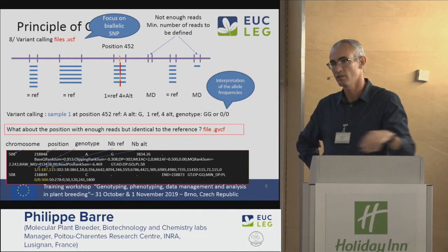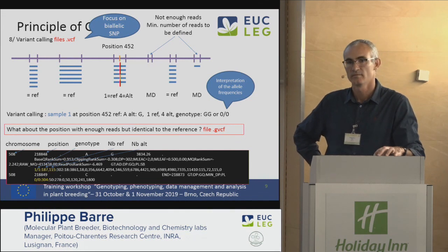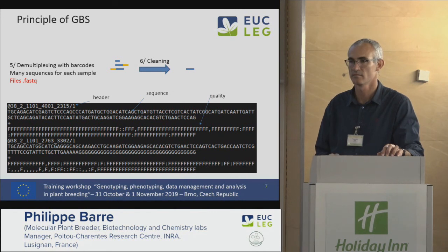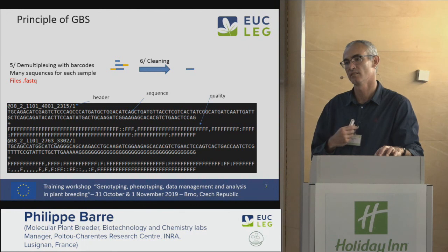Yeah, maybe another one there. It's quite a detail, but I had a question about the cleaning step. Can you show the... Yes. So you had one read with no barcode, and you said you keep it because it's already clean, but how can you be sure of the demultiplexing?